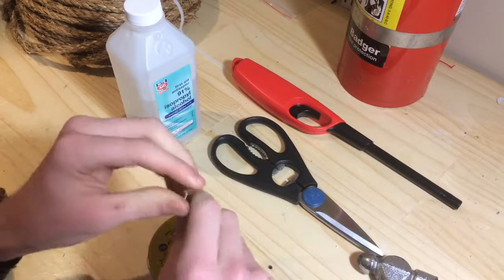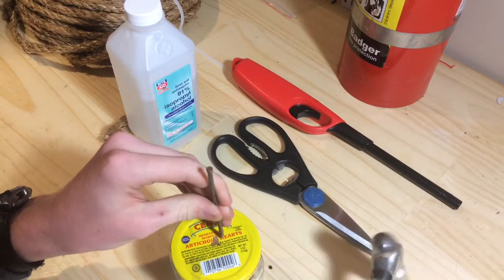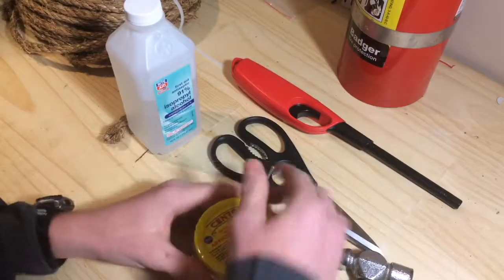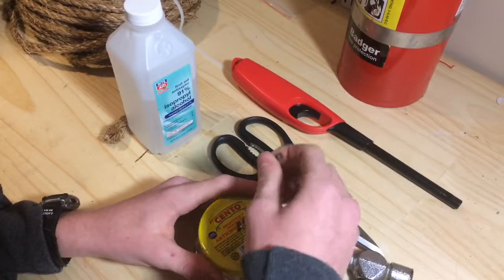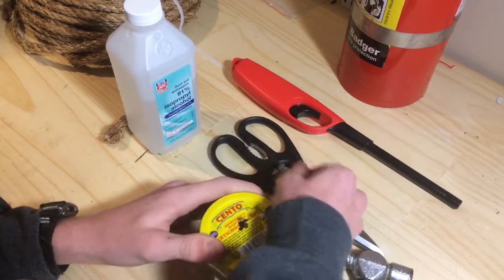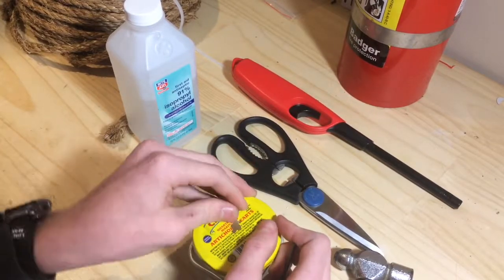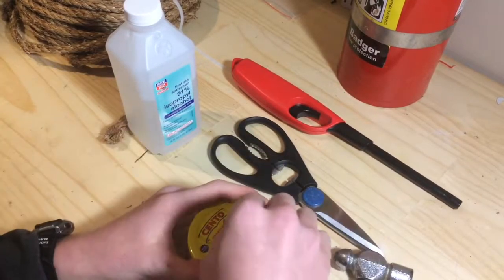Probably like one more hole right here and it will be good. And there you go. Alright, seems like it's a big enough hole.